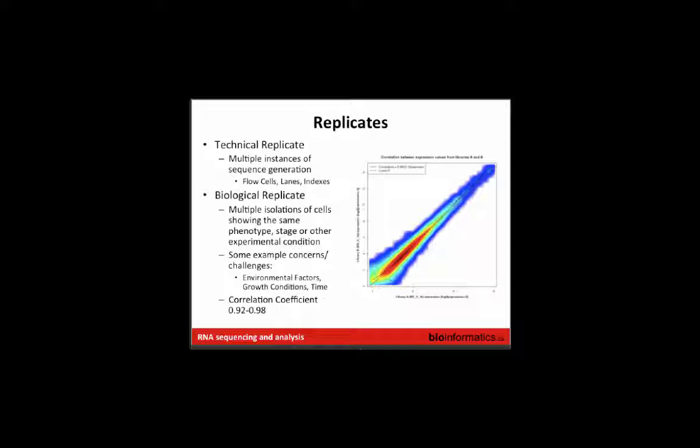But then when it comes to it, you've spent all of this time doing your biology or growing your cell lines, or the mouse took 9 months to get that tumor or whatever. And it's almost like a foregone conclusion that you're going to try to produce the data and get some results out of it. So probably most people won't throw away the data unless they really have an alternate or a backup, which is often not the case. So then I think it's really just important to think about what the effect is and whether it's influencing your results and to try to account for it. And there is quite a science to detecting bias, detecting batch effects, and trying to correct for them. You just have to be cognizant that there may be issues.